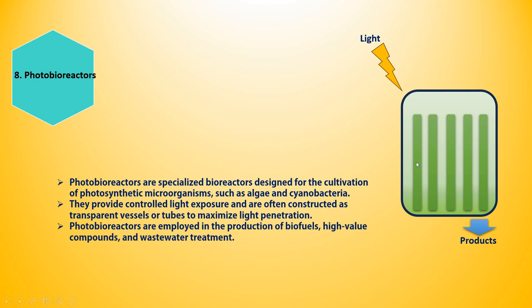And these photobioreactors have a very complex structural mechanism, and they have varied utility. So we can discuss separately about different types of photobioreactors, how they are made up, how much complexity they have, and what the different applications of these photobioreactors are. We can discuss it separately.